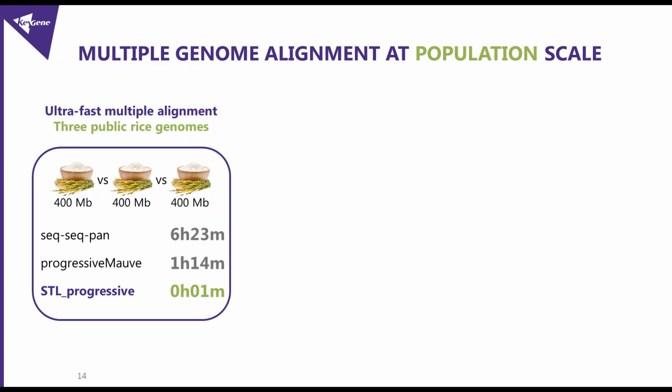But our own tool that we have named STL Progressive right now, STL stands for Sequence Tag Layout, the technology that is based on the restriction sites, the short sequence tags, and the layout of those to make a very rapid alignment, only took 1 minute.